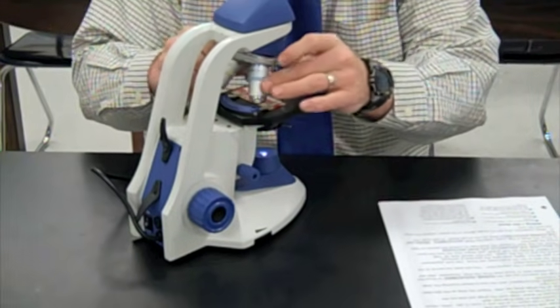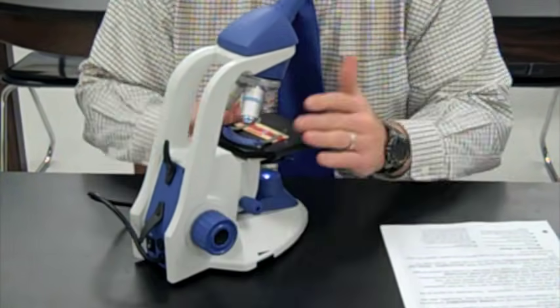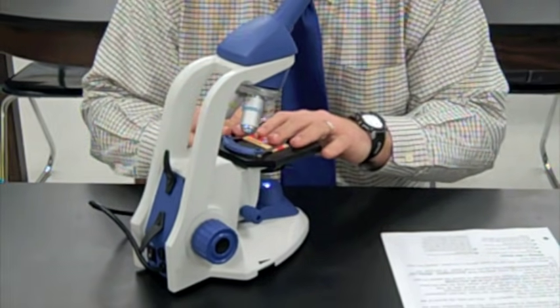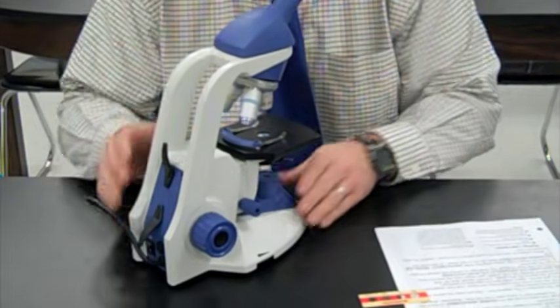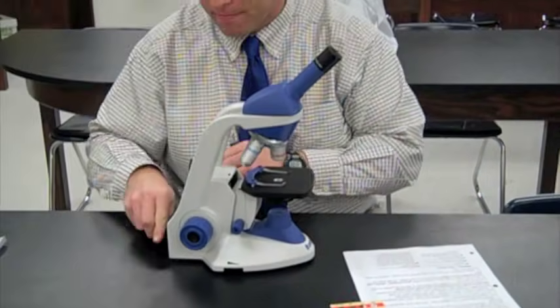Alright, now at the end of this, what I do to readjust it and basically clean up the scope is turn it to the 4x power, use the coarse adjustment to pull down my slide away from the 4x, remove my slide, shut off my scope, and again wind up my cord. Okay?